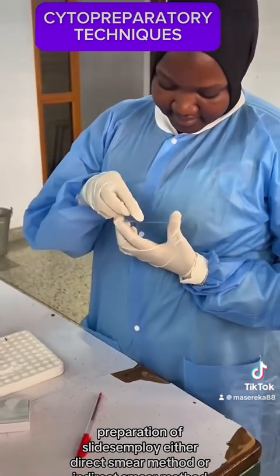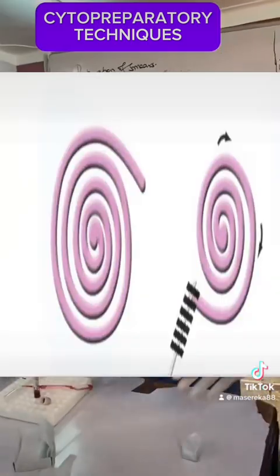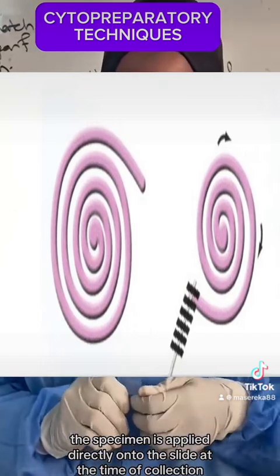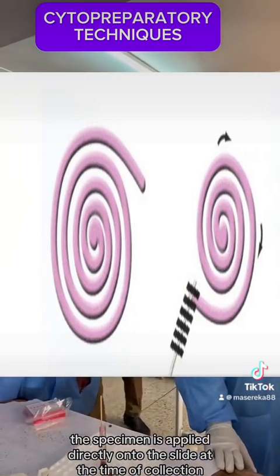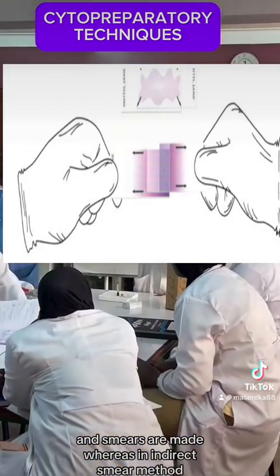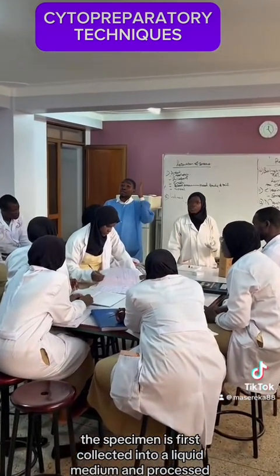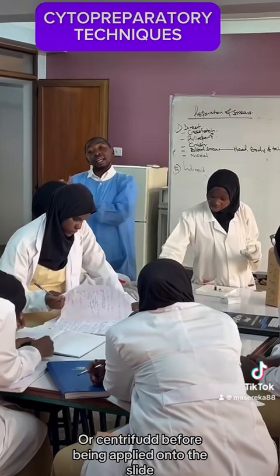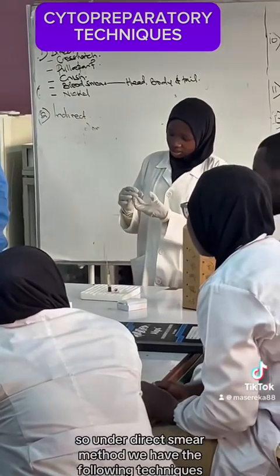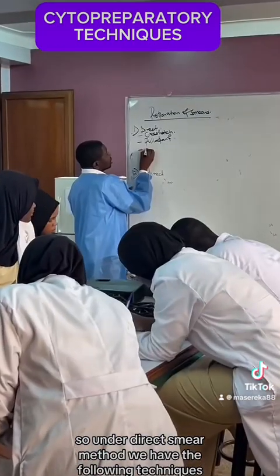Preparation of slides employs either the direct smear method or the indirect smear method. In direct smear methods, the specimen is applied directly onto the slide at the time of collection and smears are made. Whereas in the indirect smear method, the specimen is first collected into a liquid medium and processed or centrifuged before being applied onto the slide. So under the direct smear method, we have the following techniques.